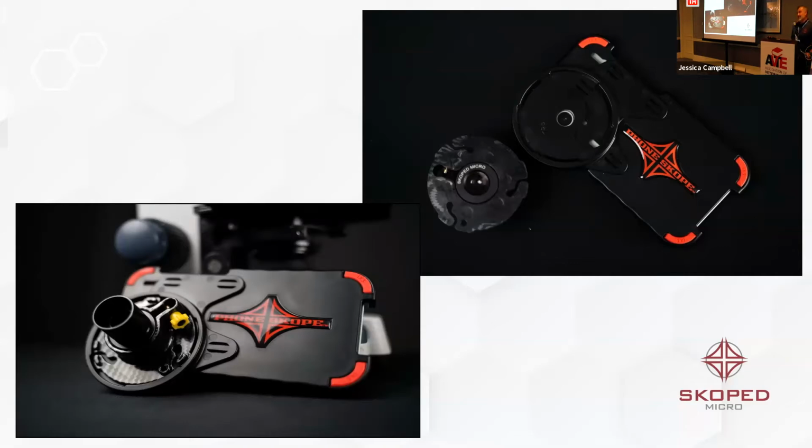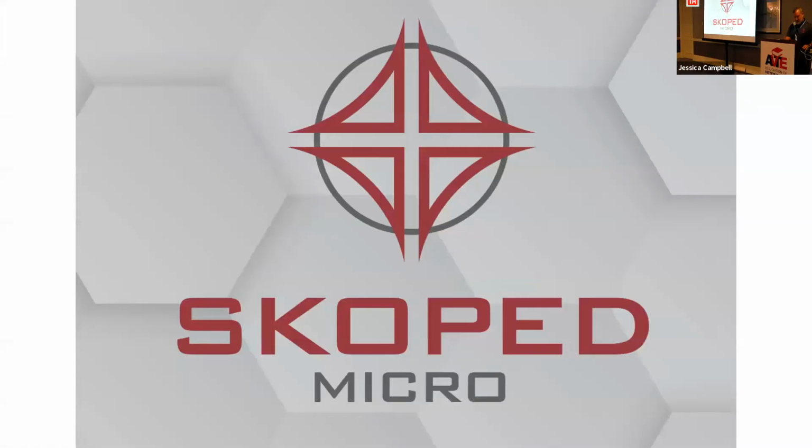I like the custom cases just because of ease of use. There are no moving parts. You just snap your phone in it, or your phone lives in it. I use an OtterBox on my phone, and we make adapters for OtterBoxes, but we also have these that can be everyday carry cases. You just take the disc out, and this can just be on your phone all the time. And then when you need to use it, it's there.